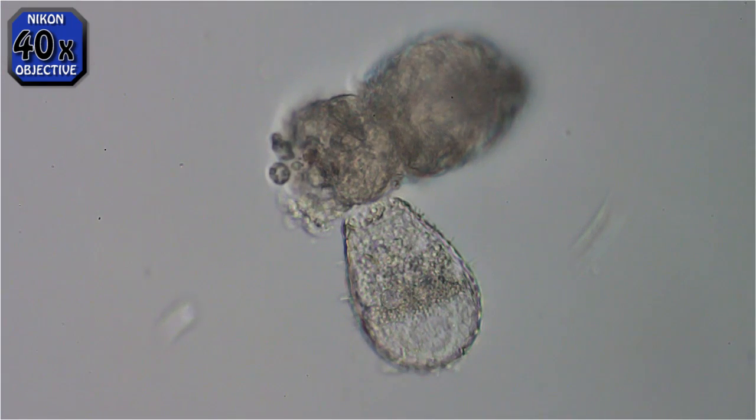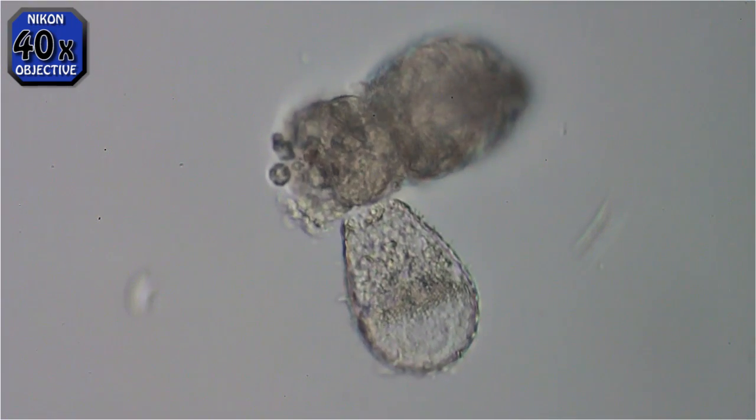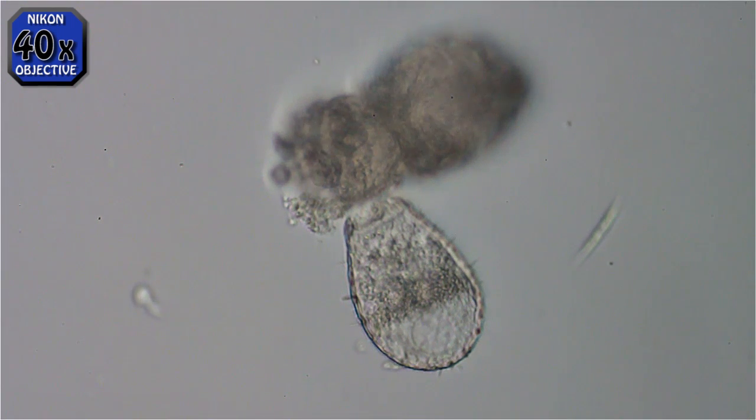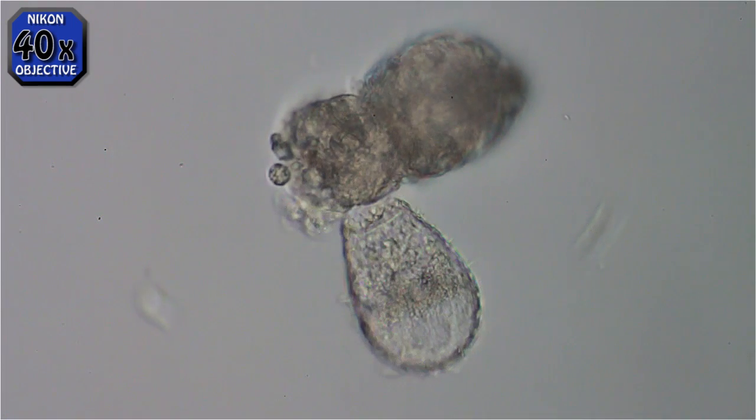Now we're back to normal speed. The vibration you're seeing — I live next to a highway, so that's probably a truck going by.